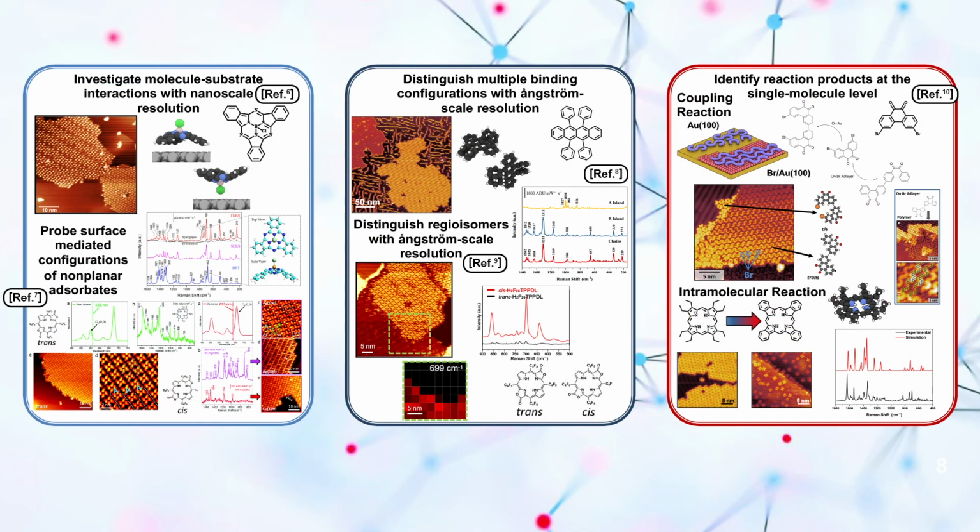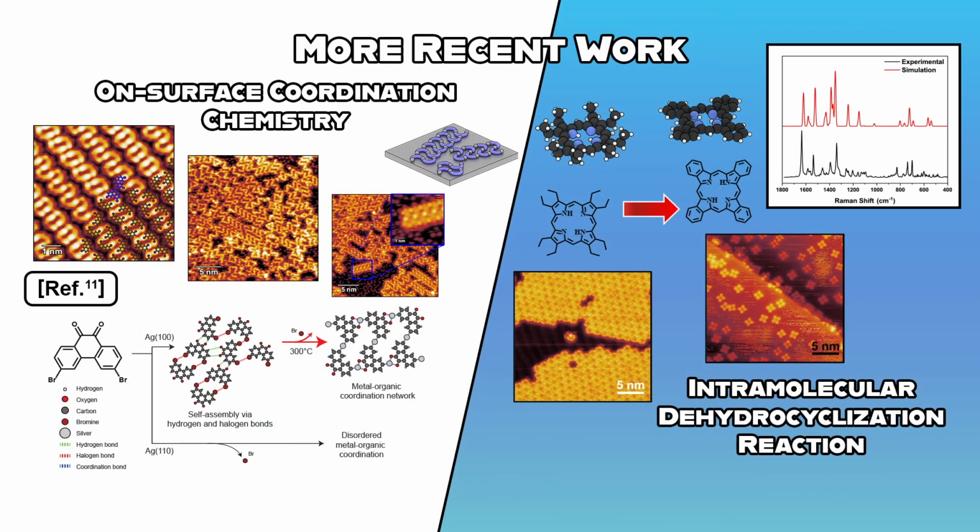The previously mentioned studies only serve as a sample of the capabilities of UHV STM TERS and my work during my studies. More recently, I have expanded to new on-surface reactions, finding unique products resulting from coordination chemistry, as well as revealing the vibrational fingerprint of the products of an intramolecular reaction.